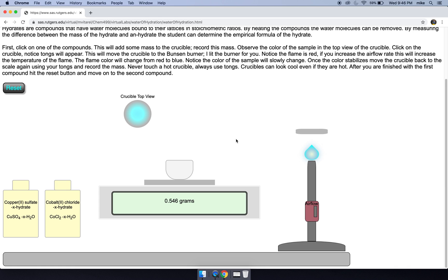Each of your samples starts with 1 grams and this sample ends up with 0.546 grams, and from those two numbers you are able to get the hydration state.